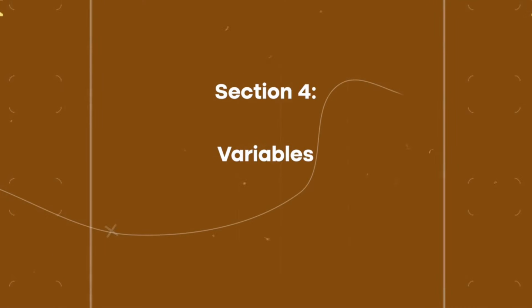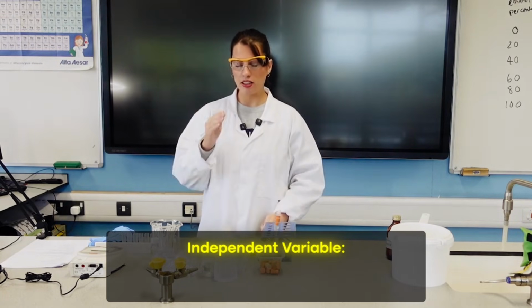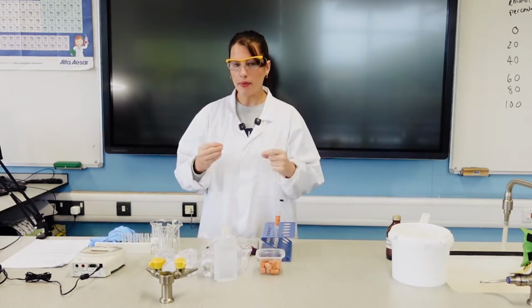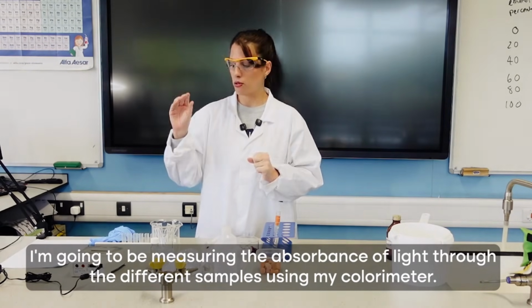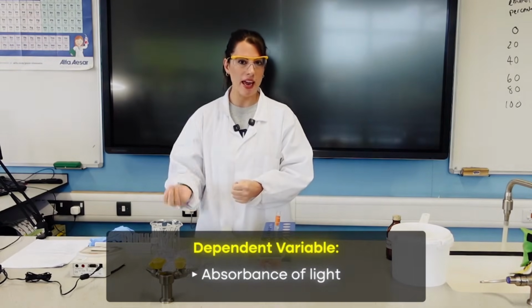So in terms of the variables for this investigation, my independent variable is going to be the concentration of ethanol. That is what I'm deliberately changing. I'm going to be measuring the absorbance of light through the different samples using my colorimeter. So the absorbance of light, that is going to be my dependent variable.